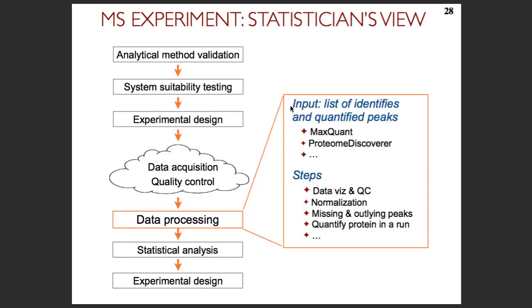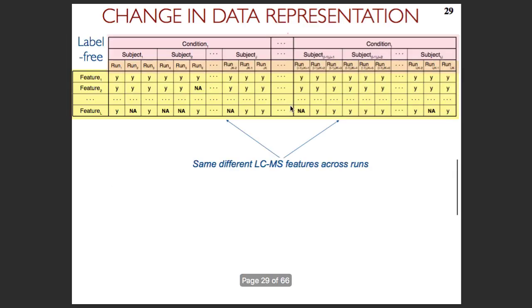Well, as in the case of MSstats, we do not do peak identification, peak picking, peak quantification, all of that. We rely on the work of people who do this better than we do. In this particular case, we have converters from MaxQuant and from Proteome Discoverer. If you have data using TMT where the peaks are identified and quantified with these tools, we can export the data into MSstats. We're also working actively with OpenMS, so I think OpenMS will be coming very soon as well. And in the future, we will probably work with other tools just the same. For the moment, that's what we have.